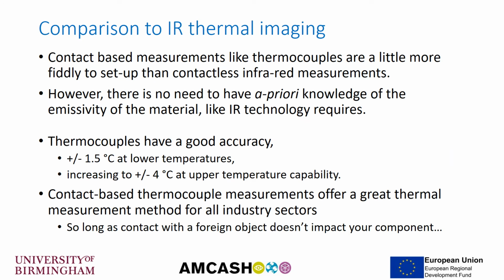So if we compare contact-based thermocouple measurements to a technology like infrared thermal imaging, we do have infrared thermal imaging capability on the project, and there is a separate video on that if you're interested. But contact-based measurements using thermocouples are a bit more fiddly to set up than the contactless IR technology. However, with a contact-based thermocouple, we don't need to have any previous knowledge of the emissivity of the material, which you would need to do for infrared technologies.